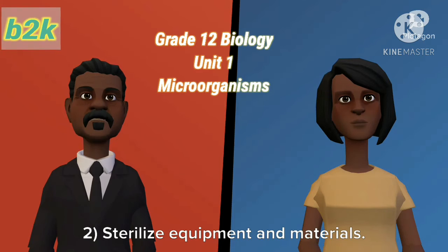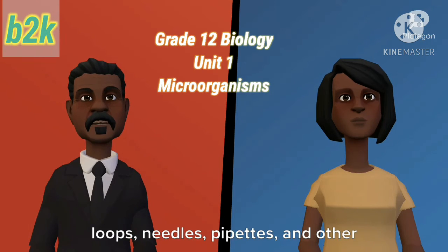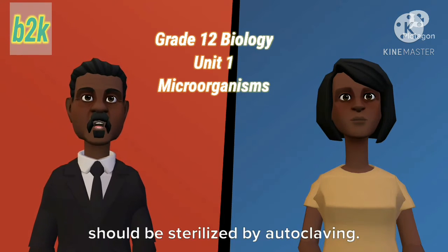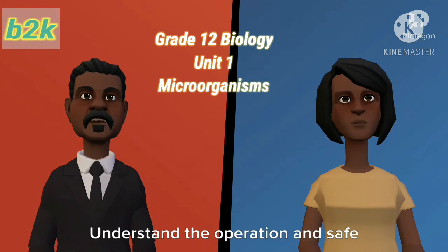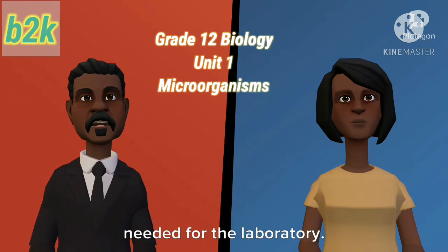2. Sterilize equipment and materials. All materials, media, tubes, plates, loops, needles, pipettes, and other items used for culturing microorganisms should be sterilized by autoclaving. Otherwise, use commercially sterilized products. Understand the operation and safe use of all equipment and materials needed for the laboratory.